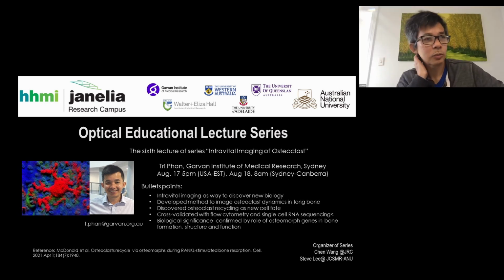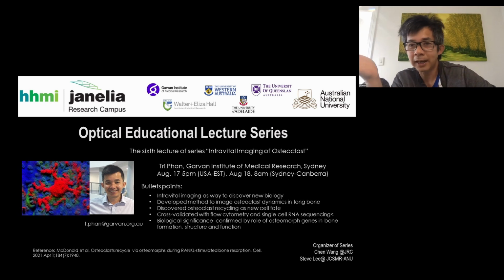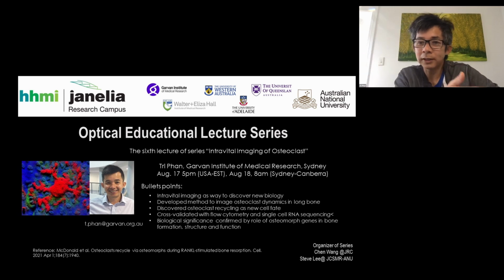With the humans, we're looking at label-free imaging, so no dyes. Most of our imaging is done using genetically encoded fluorescent proteins. But for the dormant cancer cells, we do use a dye label because it's a syngeneic cell line that we then inject into the mouse.